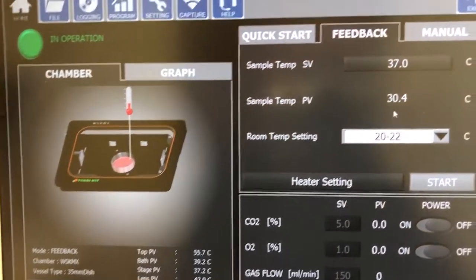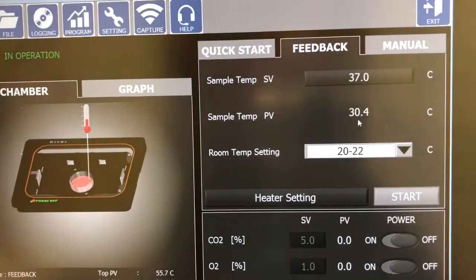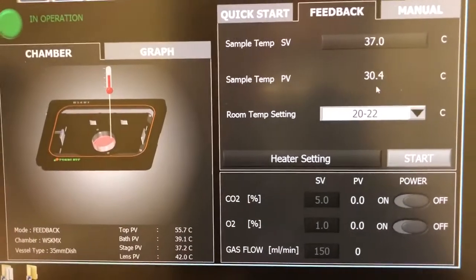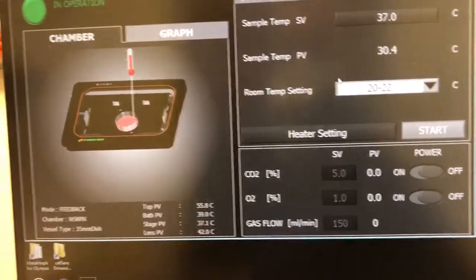And now you can see this is the measured temperature and this is the set point. So it's going to try and adjust to get there.